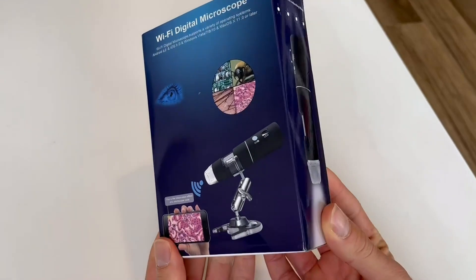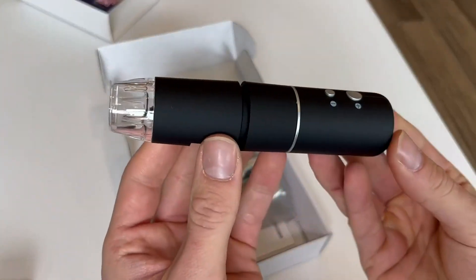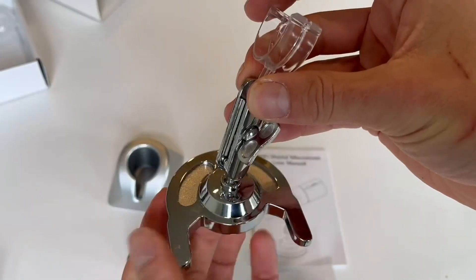So here's a quick unboxing and demonstration of the SkyBasic Wireless Digital Microscope. This thing can zoom in from 50x to 1000x magnification and it comes with instructions and everything you need to get set up.